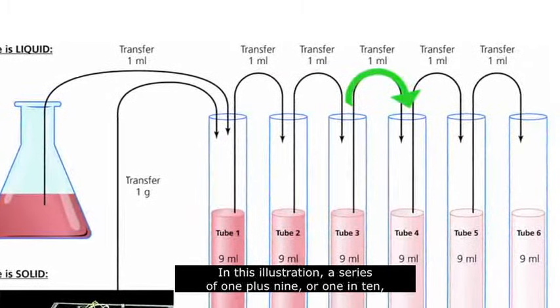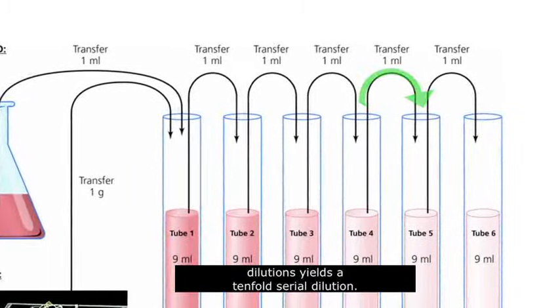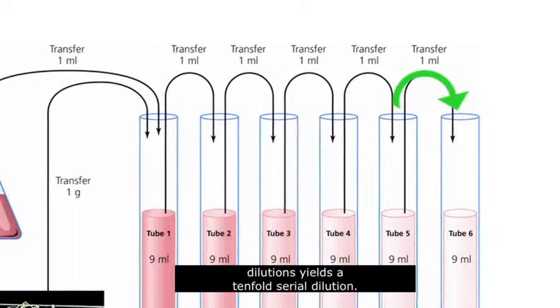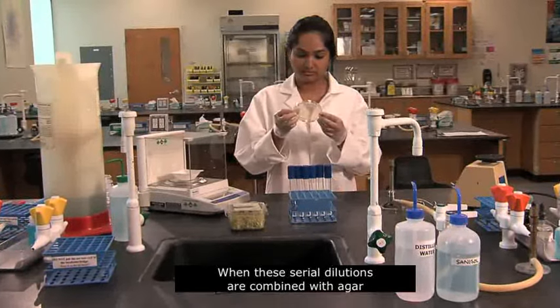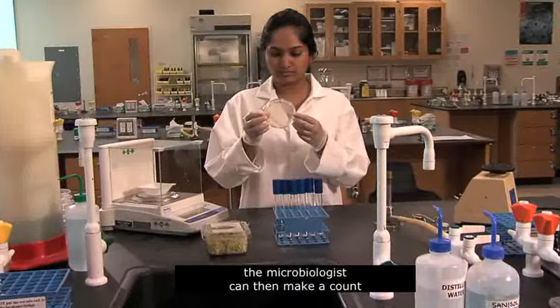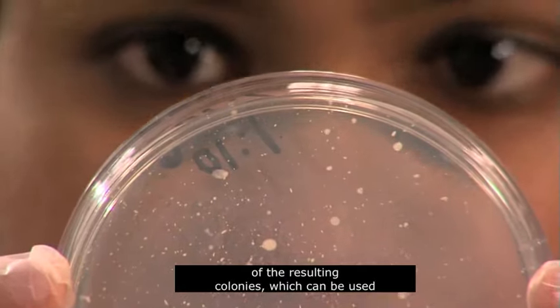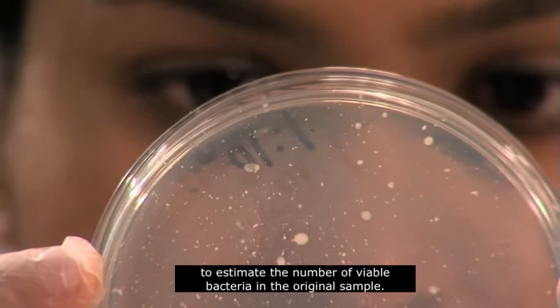In this illustration, a series of 1 plus 9, or 1 in 10 dilutions, yields a tenfold serial dilution. When these serial dilutions are combined with agar and incubated, the microbiologist can then make a count of the resulting colonies, which can be used to estimate the number of viable bacteria in the original sample.